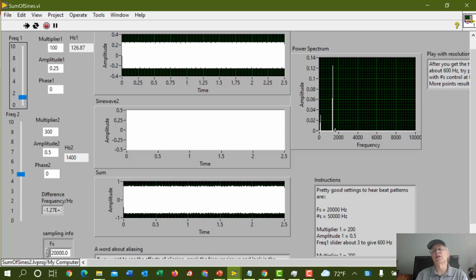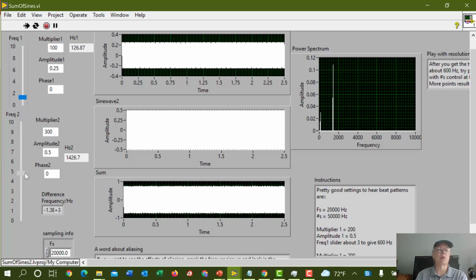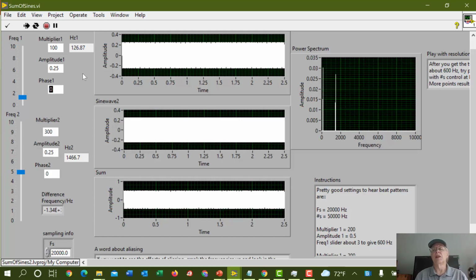Okay, and well, the Fourier transform operation is figuring out, oh, I got two waves here. Moreover, the one at high frequency has greater amplitude. Let's change the high frequency amplitude. Let's reduce that. Oops, I guess I do that here. Let's change it to 0.25 to match the other one. And now you see that they're basically the same height.